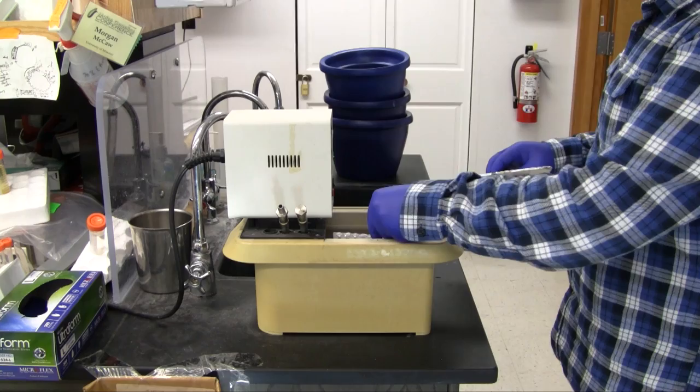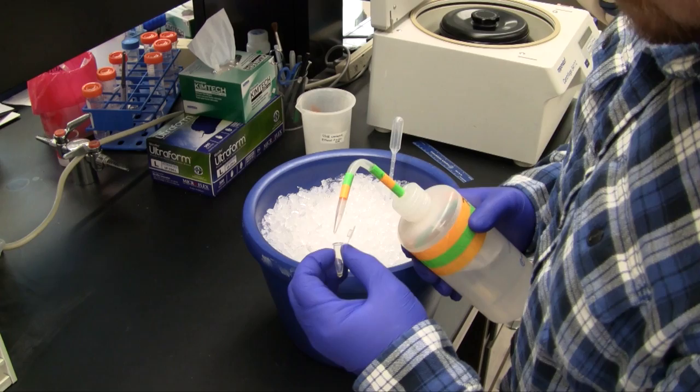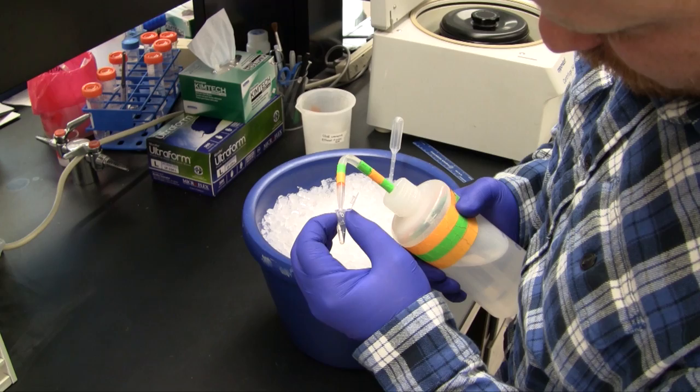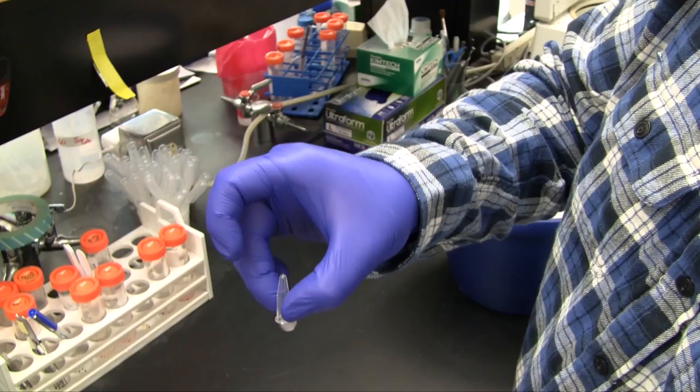After digestion, tubes are placed on ice and filled with 70% ethanol. Care must be taken, as the roots are now fragile. Tubes are gently inverted to mix. The ethanol is then removed by either carefully pouring or pipetting. Fresh ethanol is then added to remove residual enzyme. This rinse may be repeated once more.